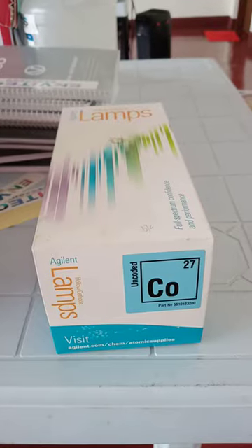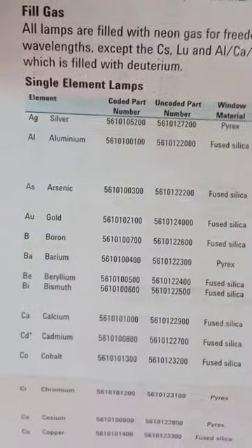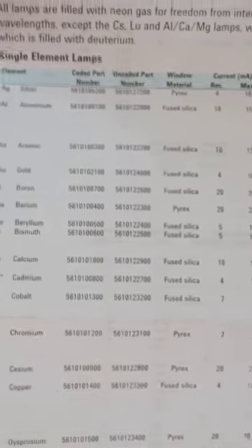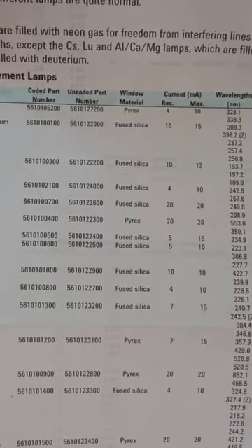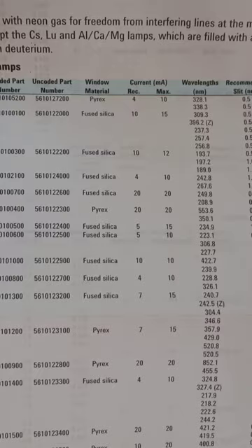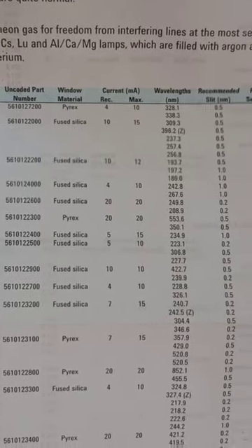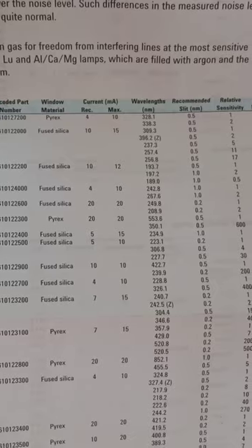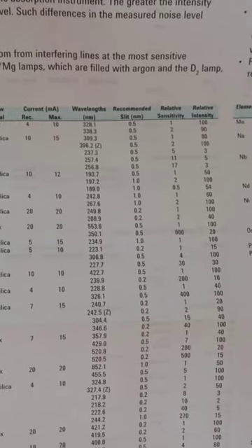This particular lamp is for Cobalt 27. The recommendations for a hollow cathode lamp for Cobalt — for example, it has a fused silica and the recommended current is 7 milliampere to 15 milliampere. The wavelength for Cobalt is 240.7, and the slit will be 0.2. This table is used for programming of your AAS.